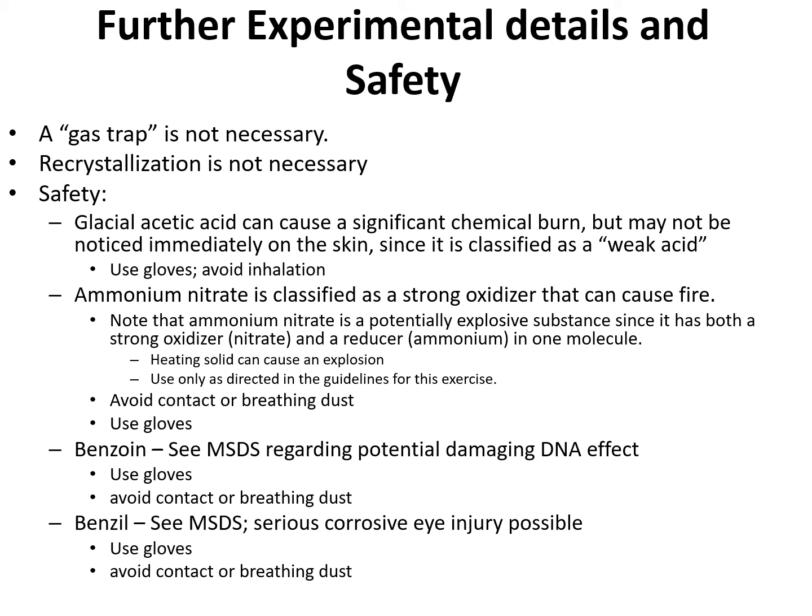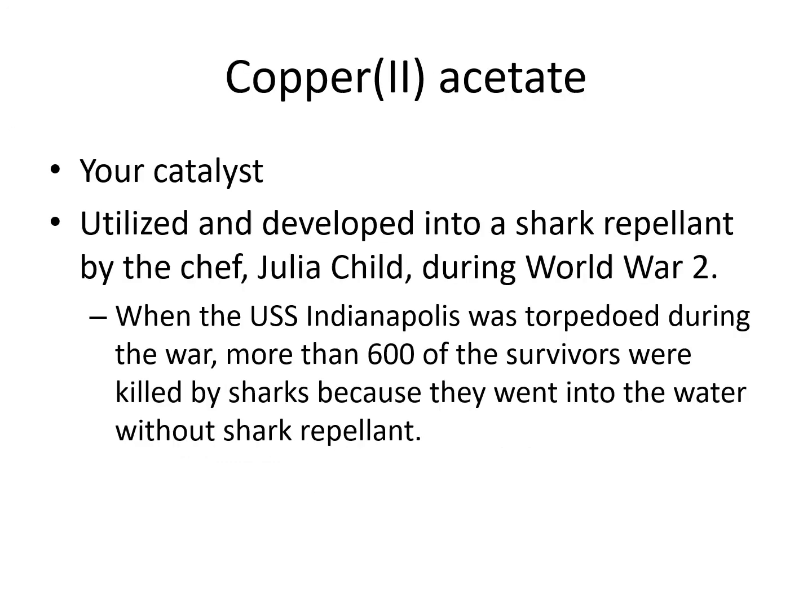For further information, I recommend you look for possible health effects of benzil and benzoin, especially benzoin, on DNA, and I'm sure the material safety data sheet will have some information about these chemicals, and it will help you if you revise that.